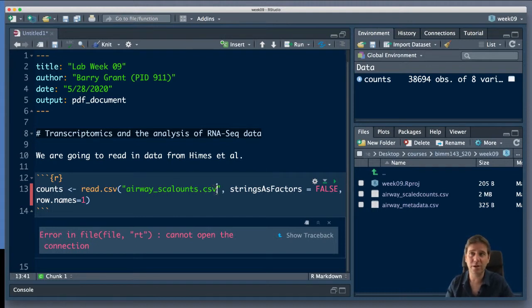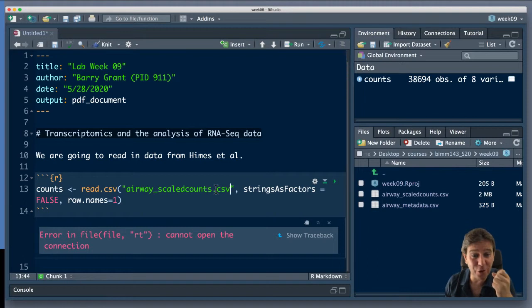I'm going to make sure I type it right. Just going to use the tab button to autocomplete. The tab key satisfies my inner laziness, but it also makes sure I type correctly, right? So it serves two purposes, and I like that. Make sure that I don't make a silly typo.